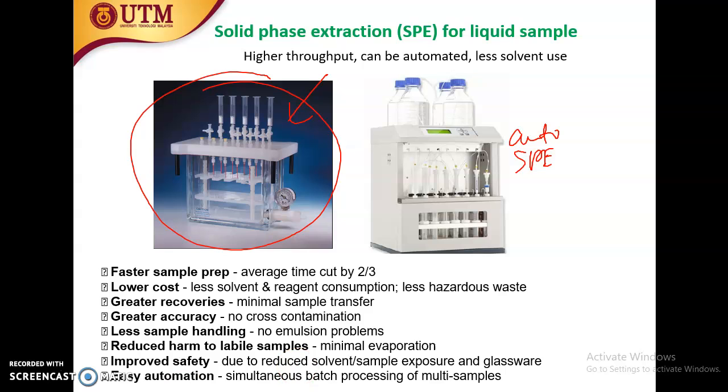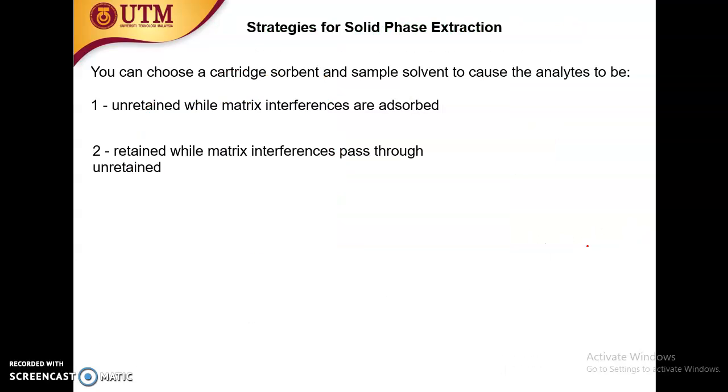Okay, you can read here on what are the advantages between SPE and liquid extraction. The greatest difference between the two of them is that SPE uses less solvent. Okay, this is if we are comparing conventional liquid extraction and conventional solid phase extraction.